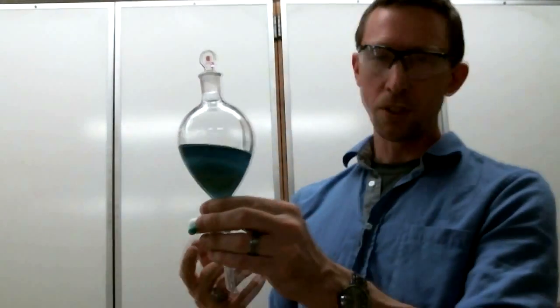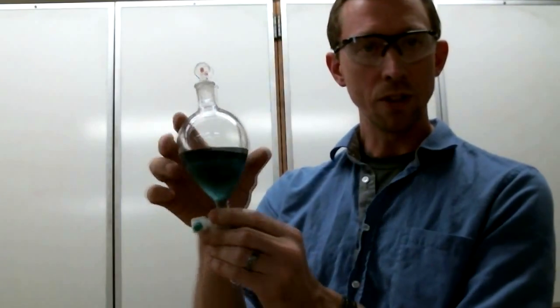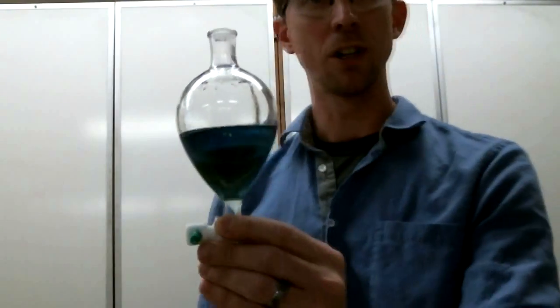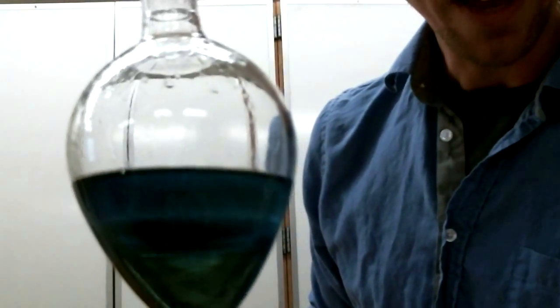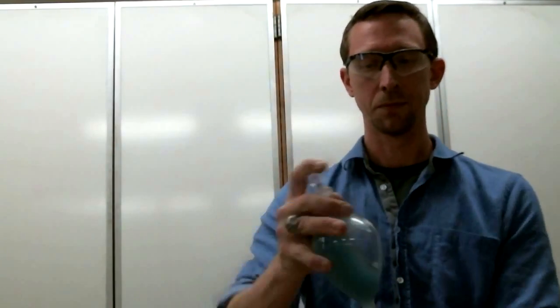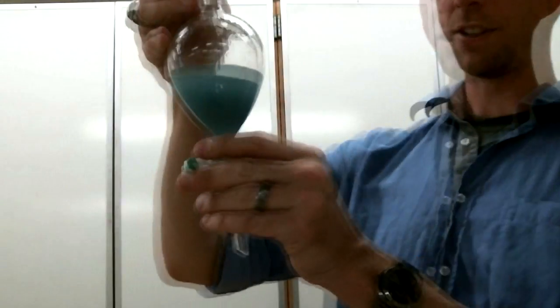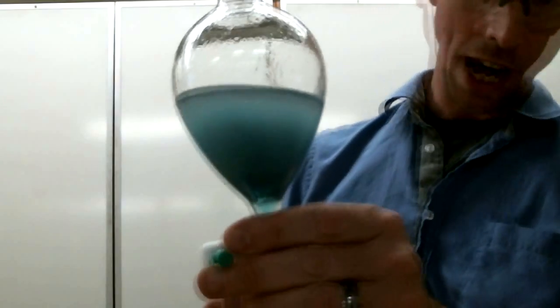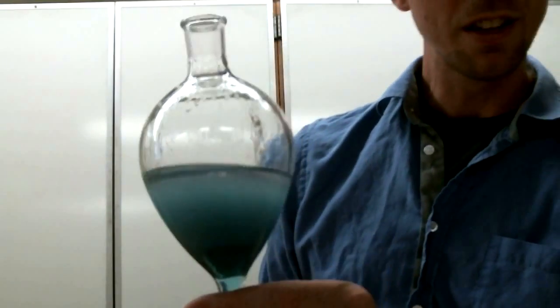And if I wait for a few moments, the two immiscible solvents separate from one another again. But we should notice something has happened. If we look a little bit closer, you can see that those blue dye molecules are beginning to migrate into the aqueous solution. And if I give myself enough time and agitation, I can get not only some, but almost all of these dye molecules to move over. All right, let's let it isolate itself one more time here. You see that now we've actually got a darker solution forming underneath than we do on top.